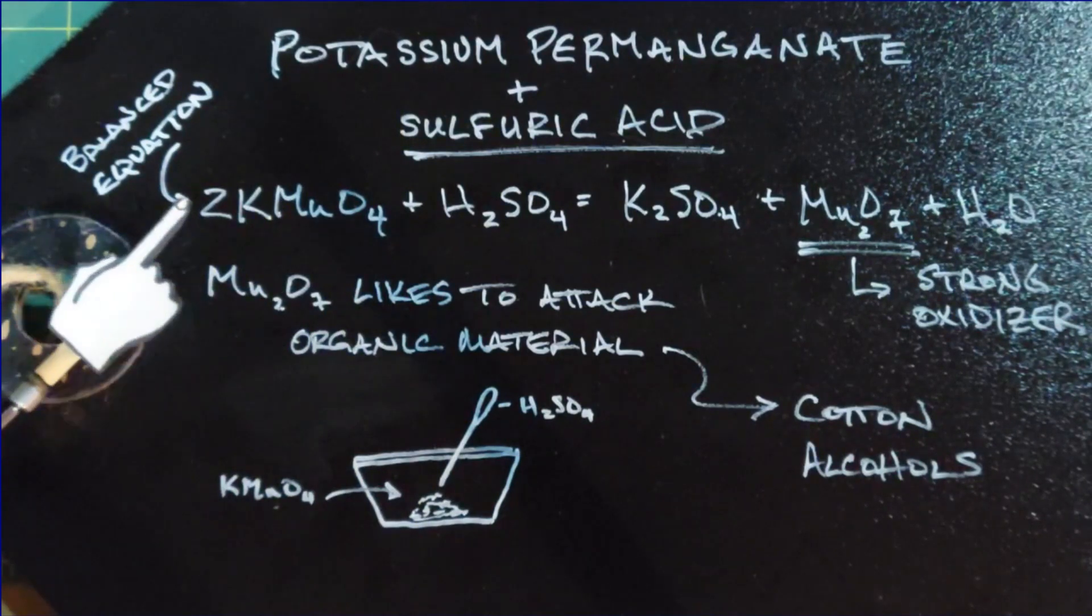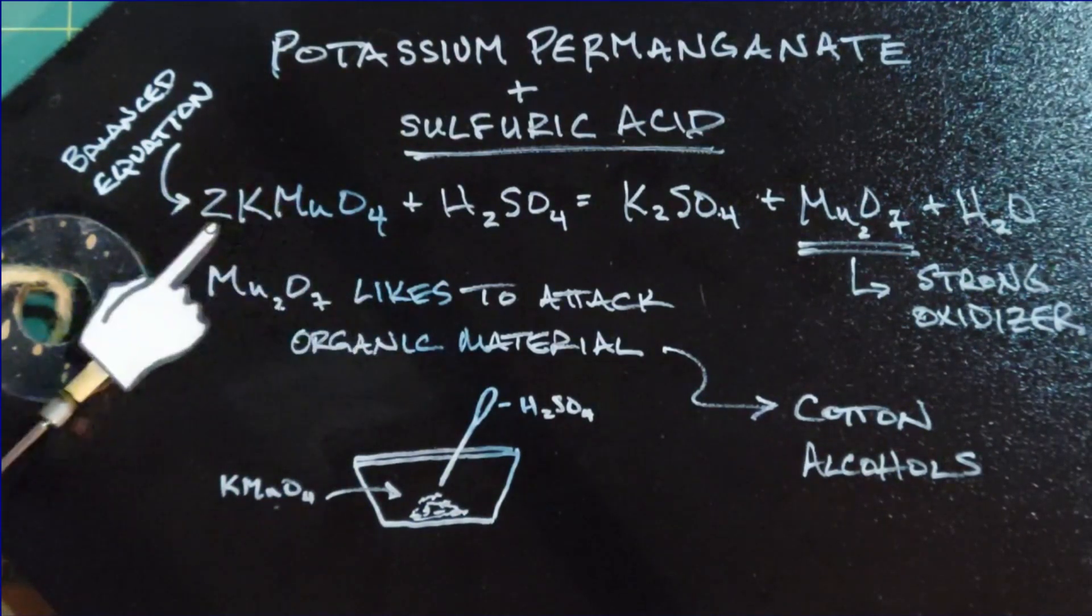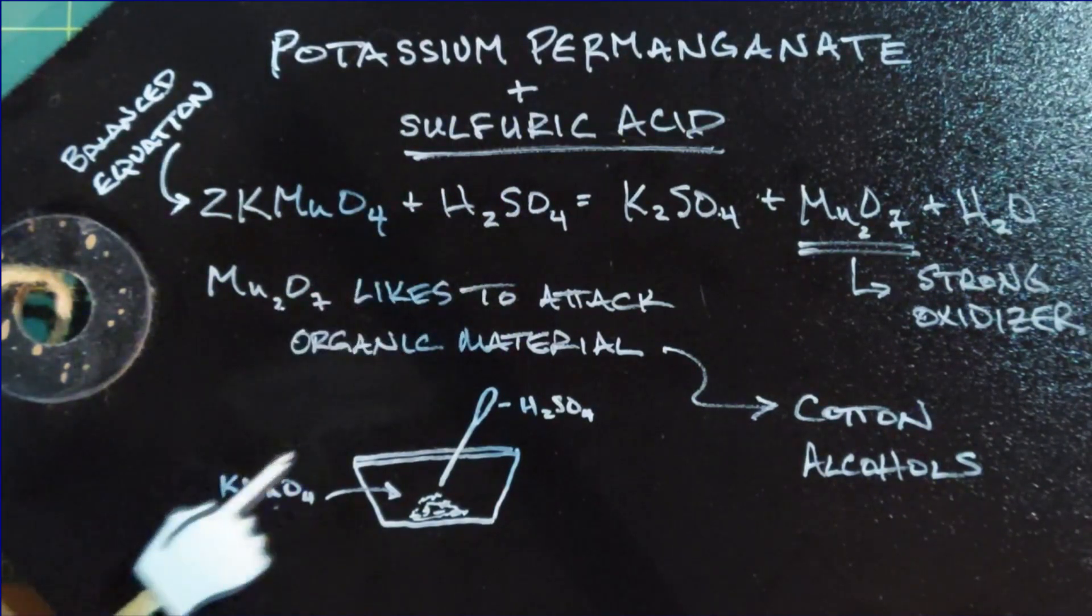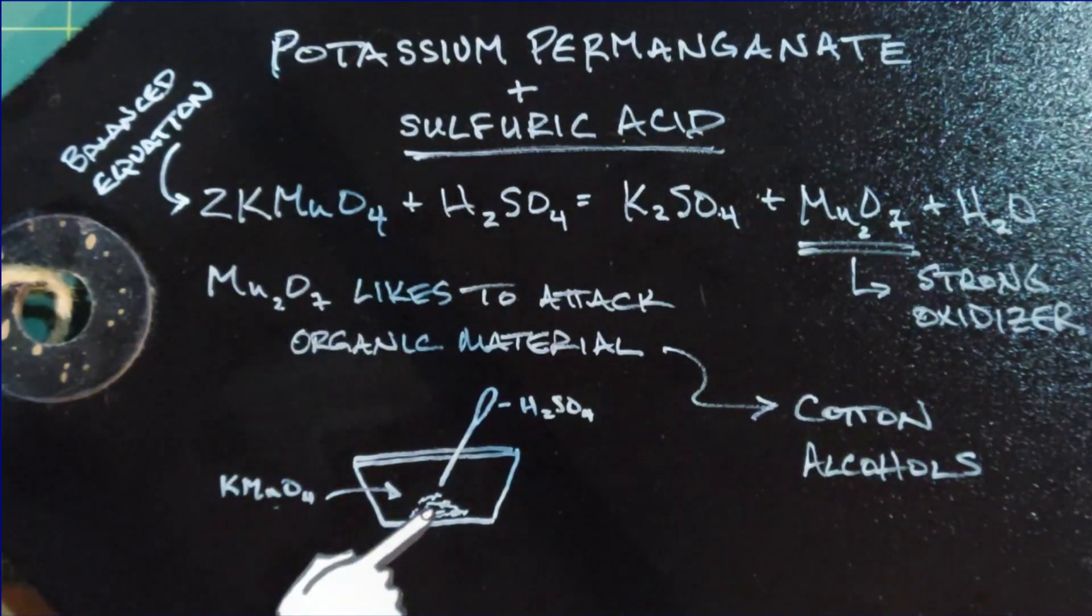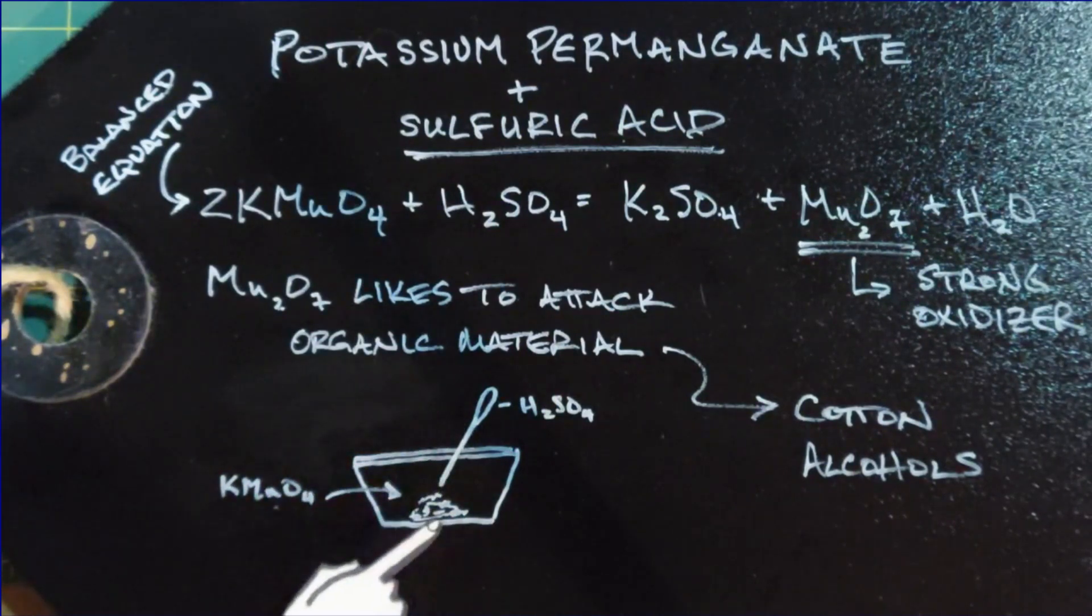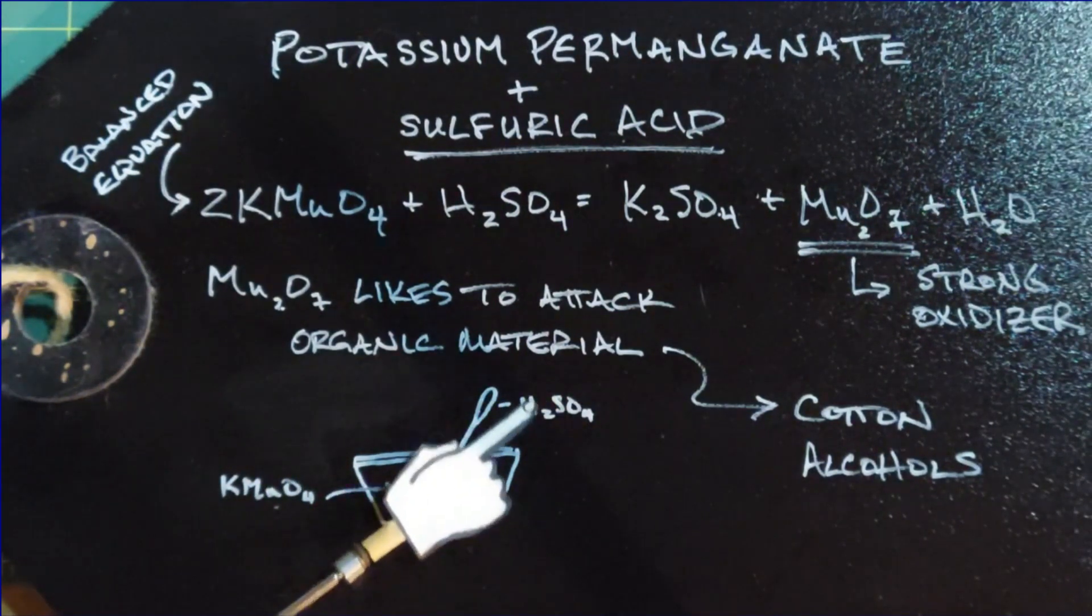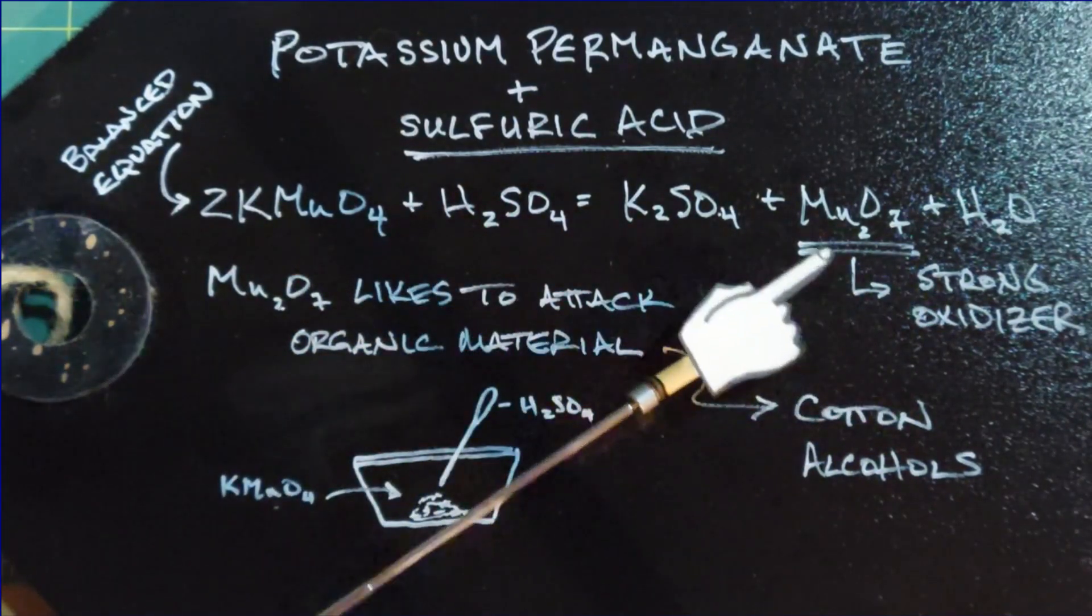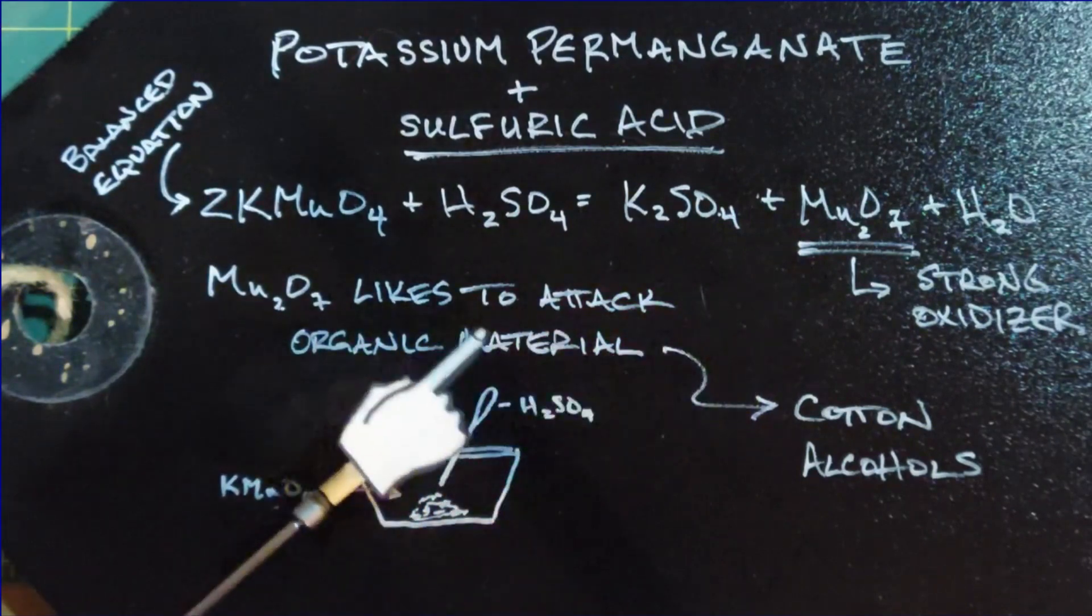As we can see from the equation here, we want twice as much of the potassium permanganate as it has sulfuric acid. So what I'm going to do is make a small pile of the potassium permanganate and then slowly add the H2SO4, or sulfuric acid, until it's saturated. If I put too much of this in, it becomes unbalanced and you will not get the strong oxidizer formed in quantities necessary to attack the organic material.